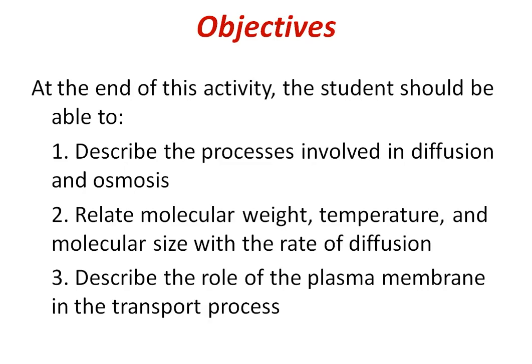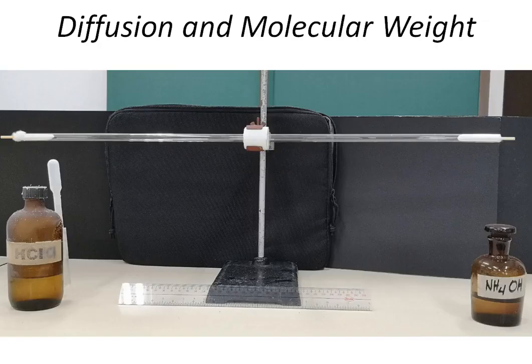So let's first look at our exercises, demonstrating diffusion. First, we will look at the relationship between diffusion and molecular weight. In this activity, the student will investigate the relationship of molecular weight and diffusion rate. So in part 1, we have this setup.